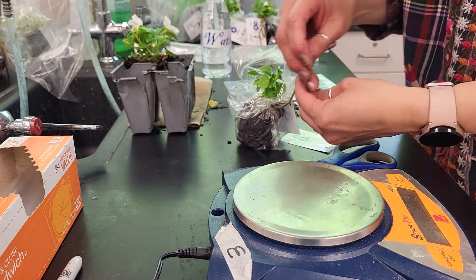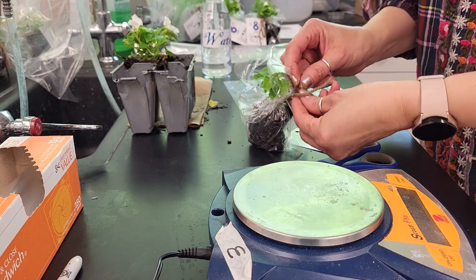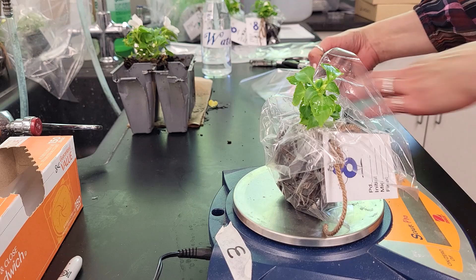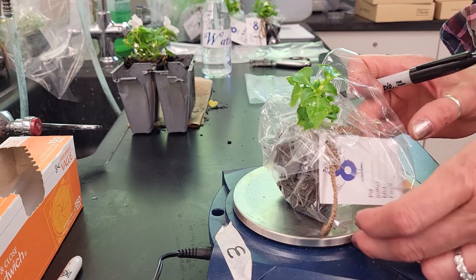This one is 93.16 grams, and another is 93.67 grams. We'll set those aside as well.